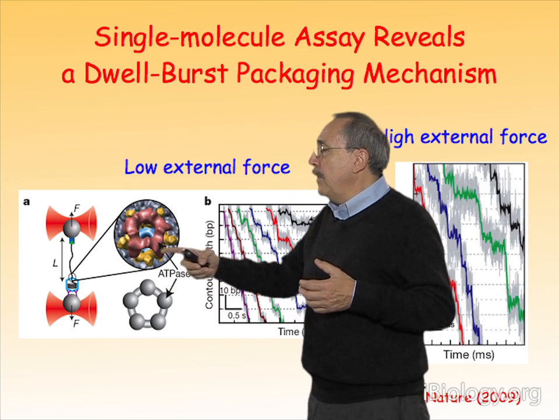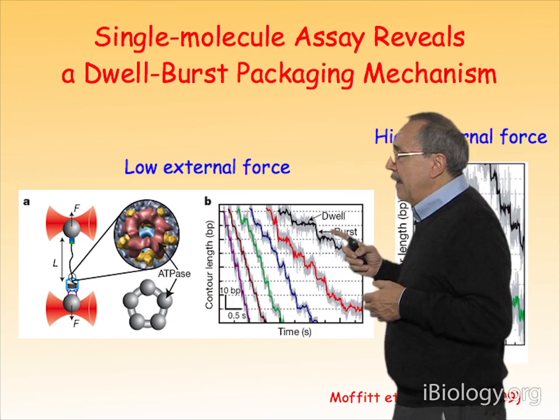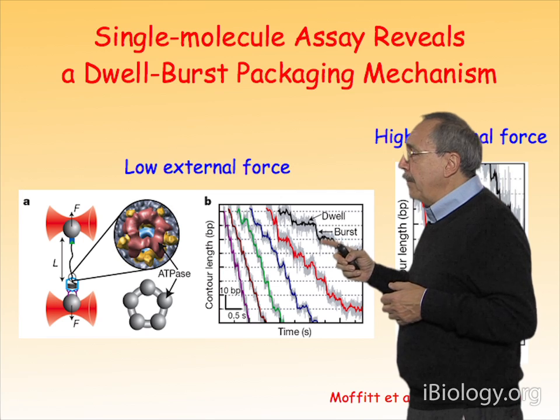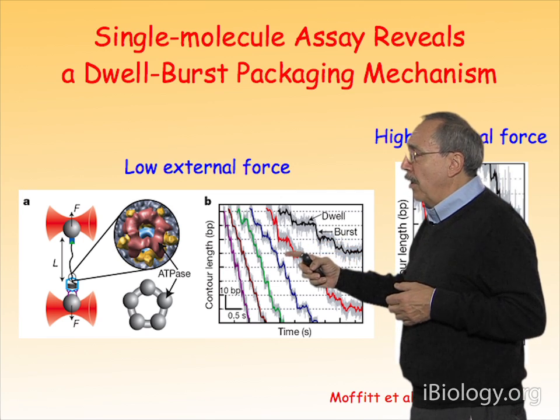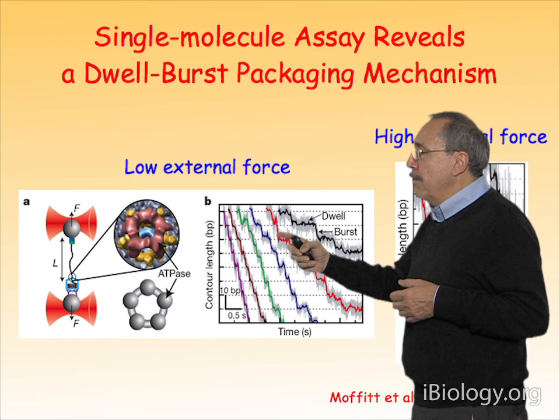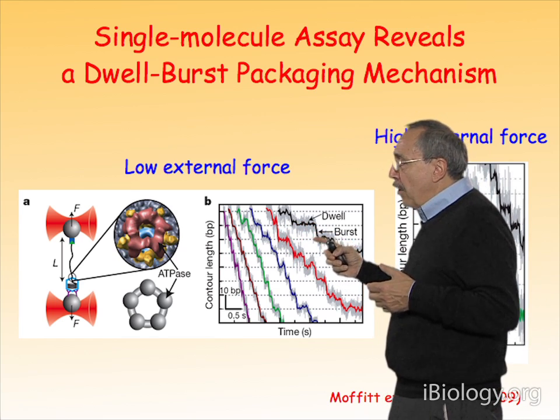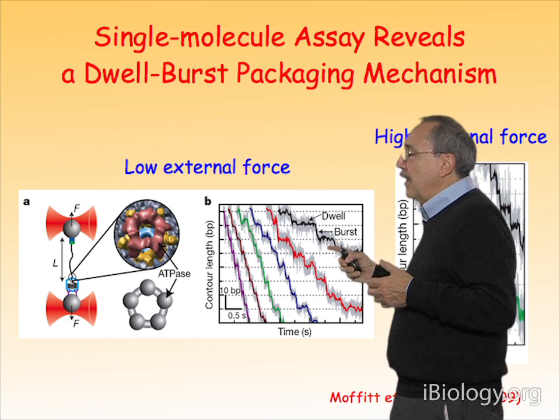And using this system, we've been able to resolve the steps of the motor, and you can see that for different concentrations of ATP, and each one of these curves involves higher and higher concentrations of ATP, the motor moves in this dwell manner, followed by a burst, and then dwell, followed by a burst, and so on and so forth.